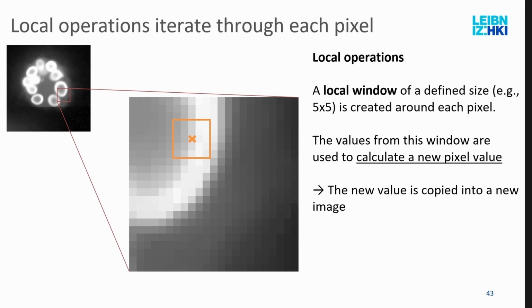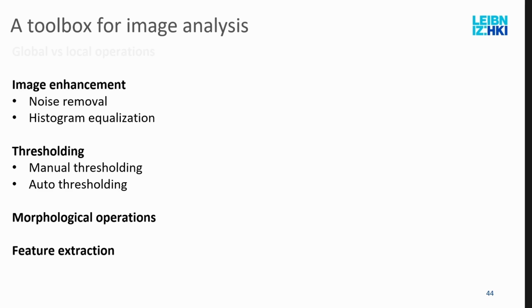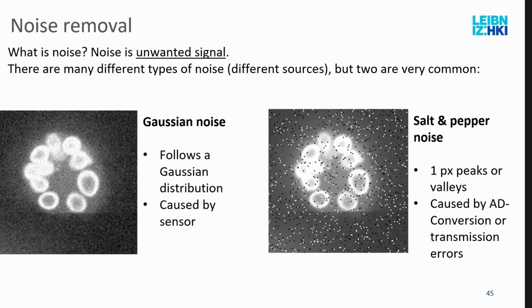This is why it's always like taking two images. And I have a few concrete examples, so don't worry. Then it repeats that for the other pixels, basically going through the image like that.